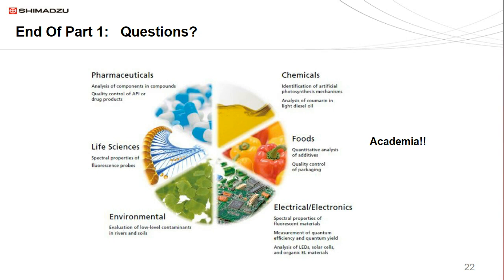The excitation and emission slit widths do two separate things in a ratioed fluorometer. A ratioed fluorometer is an instrument that splits off part of the light intensity of the lamp and has it shine on a separate detector, and this then feeds into the detector to make the instrument stable over time, but it also changes what the slits do when you change them.